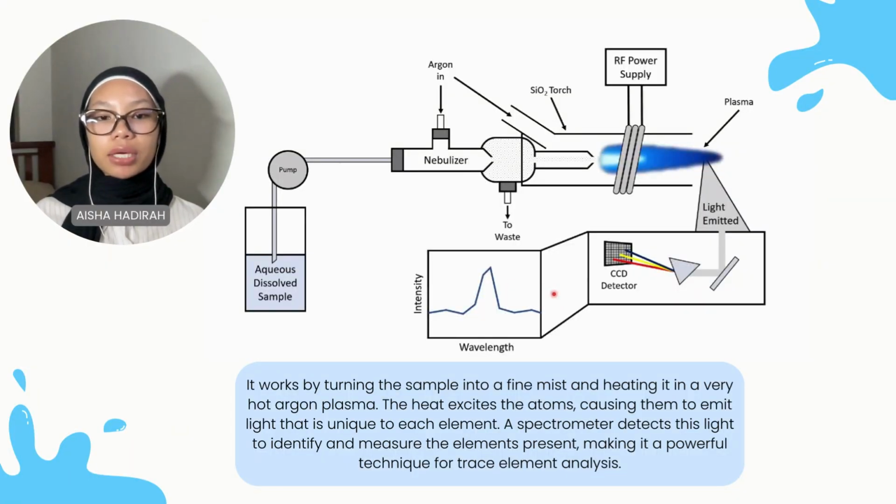How does ICP-OES work? It works by heating and ionizing atoms in a super hot plasma of argon, which emit light of a wavelength specific to each element, which is then separated and measured by a spectrometer to identify and measure the elements in the sample, which are then used to determine the elemental composition of the sample. It is an effective method of trace element analysis which reduces liquid samples into fine aerosols and then excites atoms which emit glowing just like a neon light.